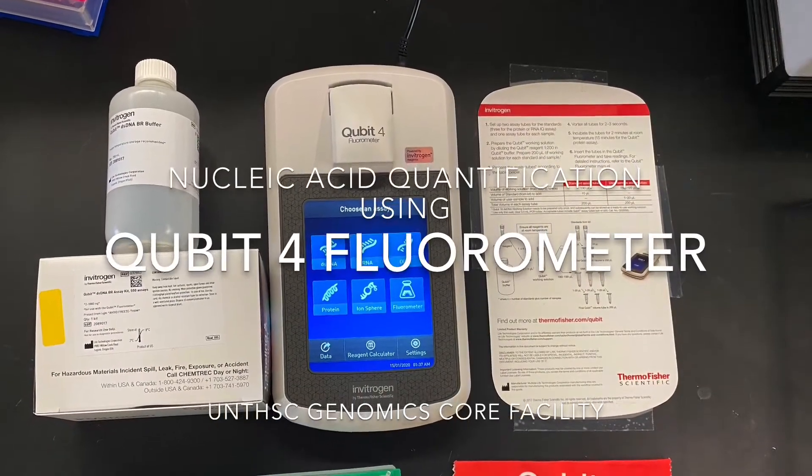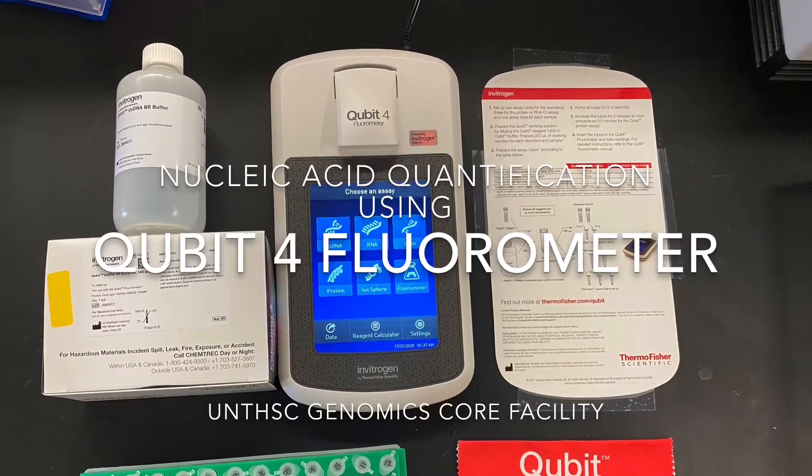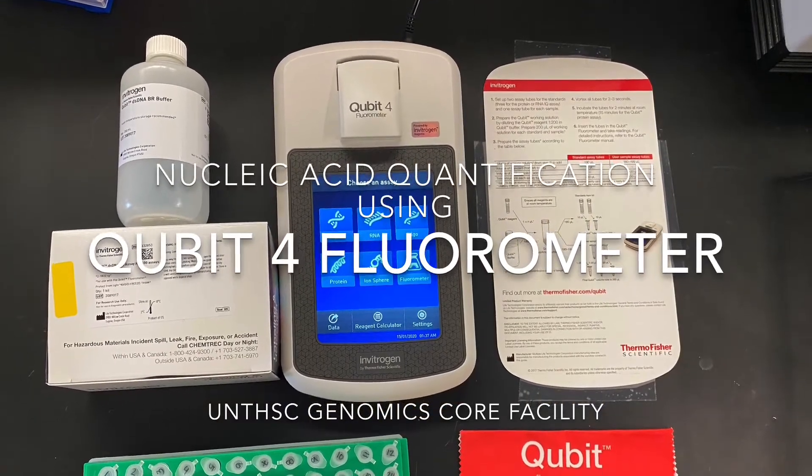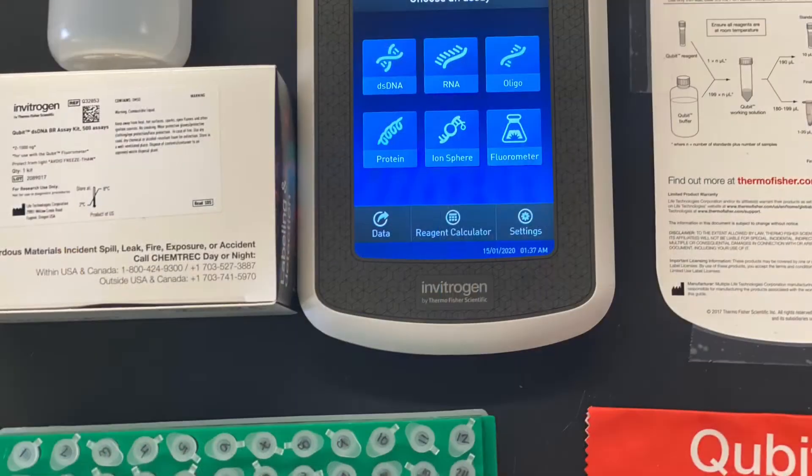Today I'm briefly going over the Qubit workflow for nucleic acid. This method is standard with our typical QC workflow with any library prep or sequencing services, but we also offer it as a standalone service.